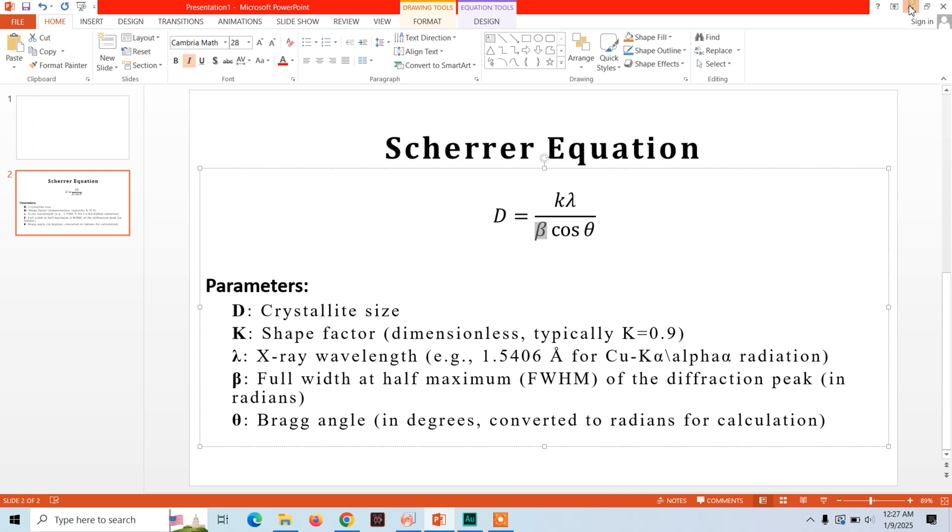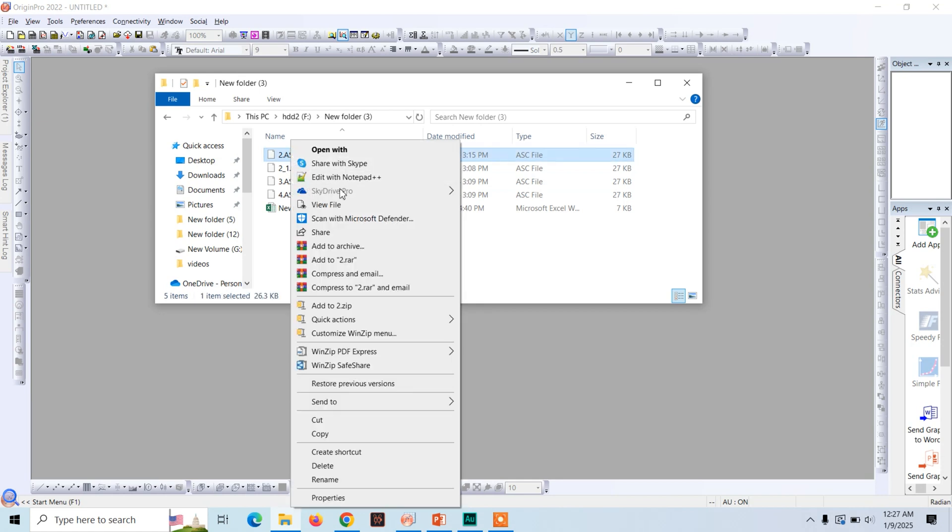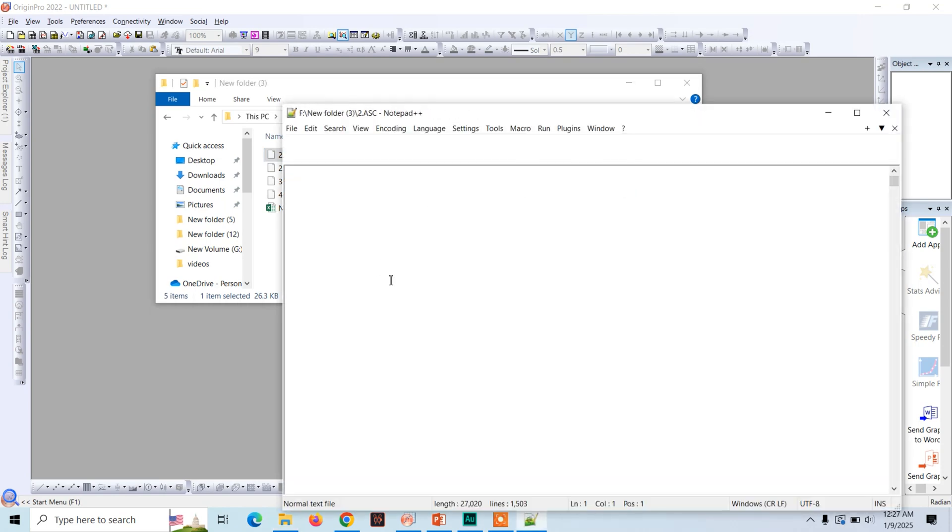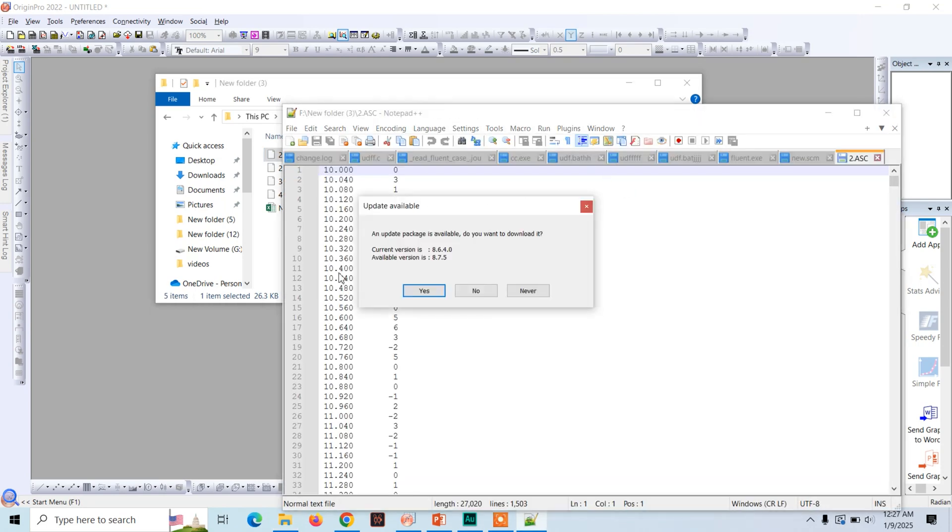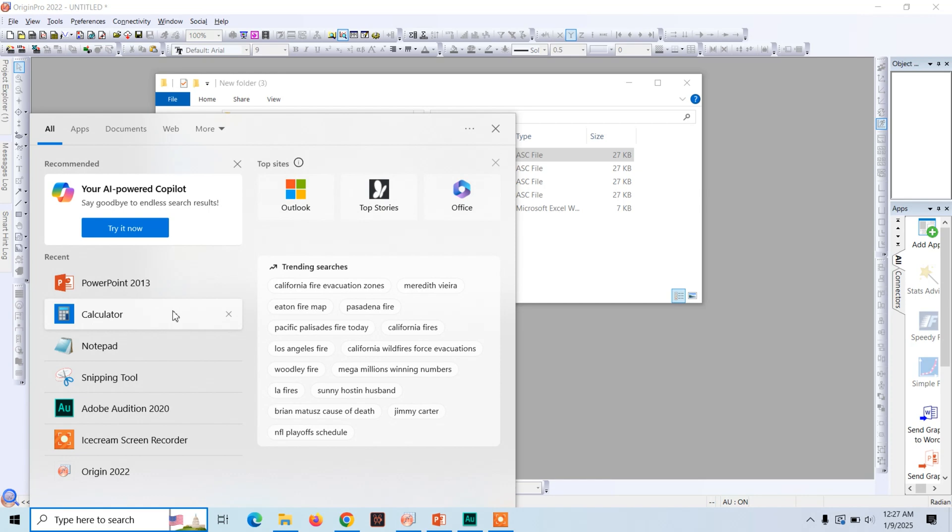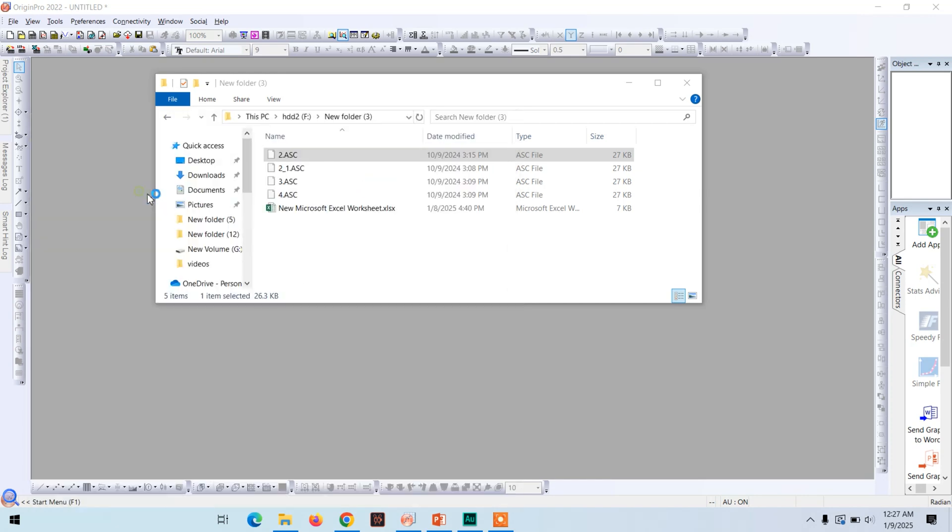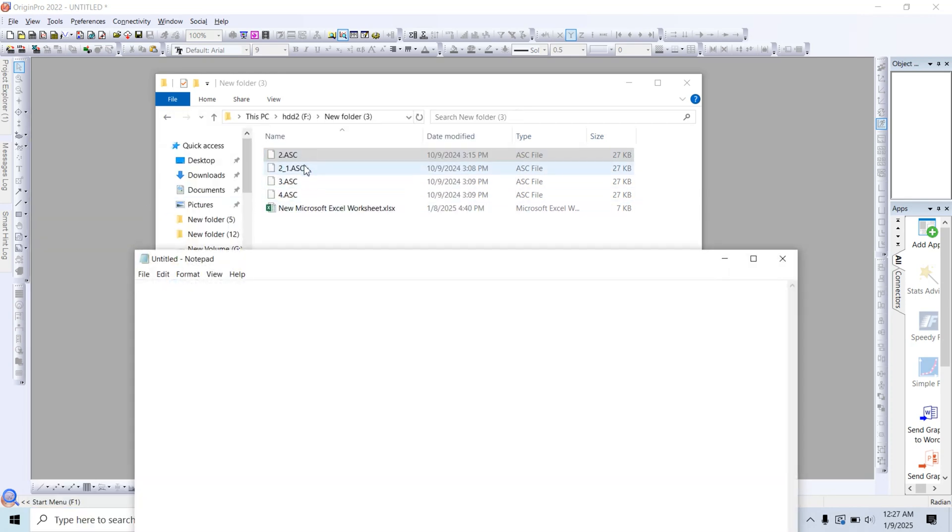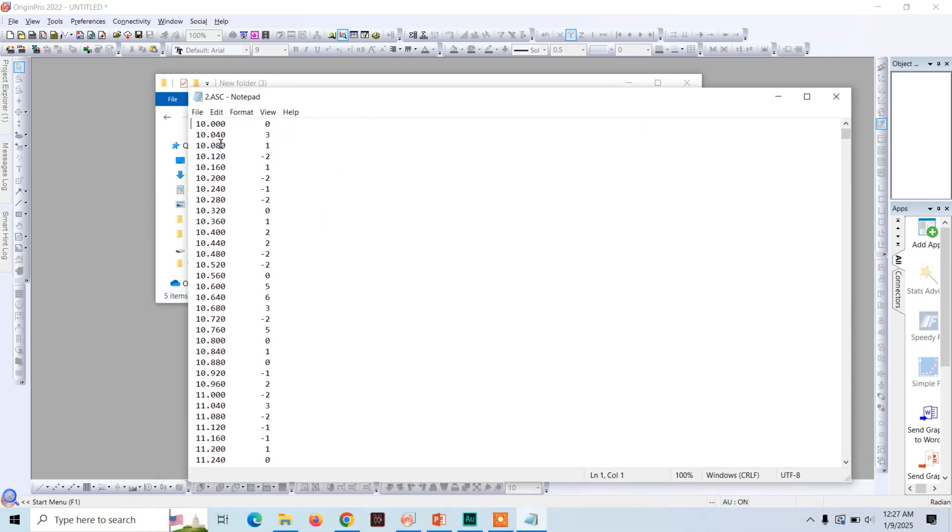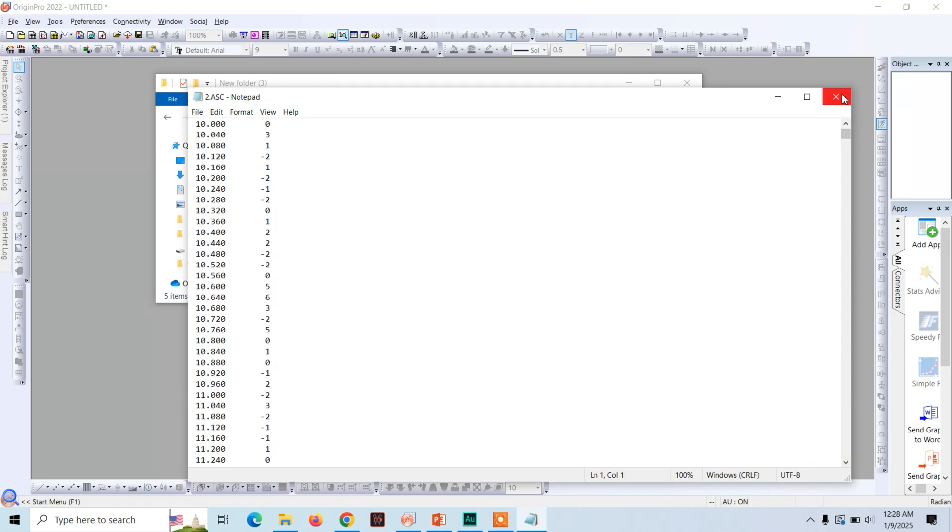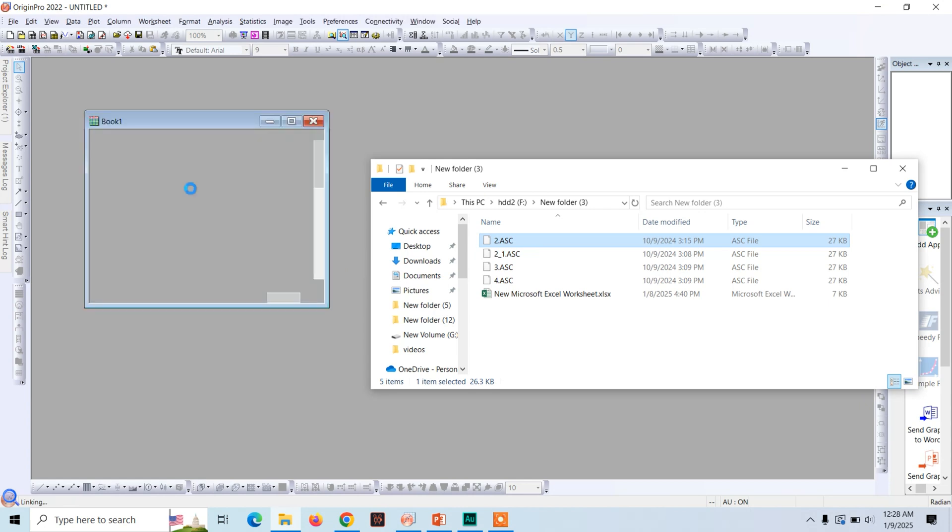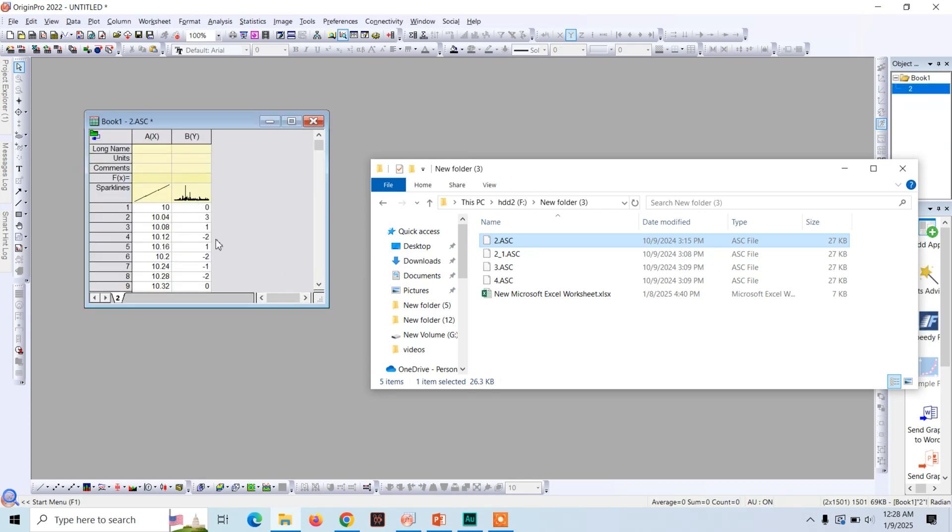Now let's begin. Here is the XRD data in ASC format. You can use the data in notepad or notepad plus plus. Once you visualize this data in text notepad, drag and drop it here. Here you see the x-axis data and on the right hand side you see the counts or intensity.